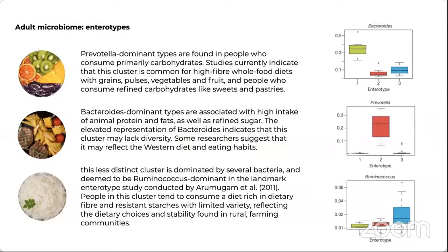So when we are performing this analysis, we can actually identify and list, for example, bacterial phyla such as Bacteroidetes and Proteobacteria, and their involvement in maintaining the symbiosis. Firmicutes is usually associated with the increased level. So these are several different associations that we can perform.